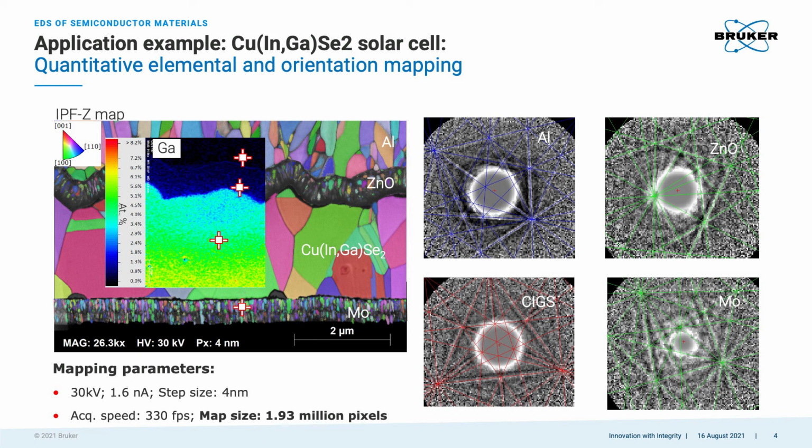In SEM, it's not that simple. And also, if you want to see smaller structures, the acceleration voltage needs to be a little bit lower. But it's amazing what the deconvolution can do, and also how fast one can go if one has the right detector. There are different detectors available, standard side entry detectors or annular detectors.